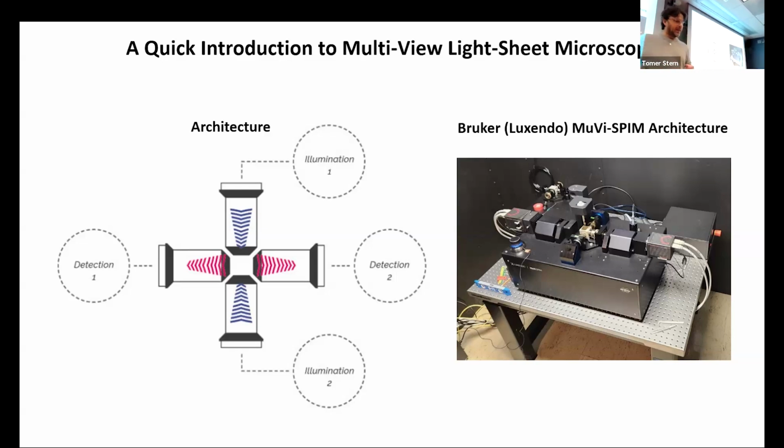For that, we're using light sheet microscopy, a technology that, let's say, came back to life about 10 years ago. And the idea here is a bit different. So we have here two illuminating beams that create this laser line. This laser line fluctuates like 70K hertz or something like that, that creates the illusion that you have a sheet here. So this is why we call it a light sheet. It's a line, but it's a very fast one, so we call it a light sheet.